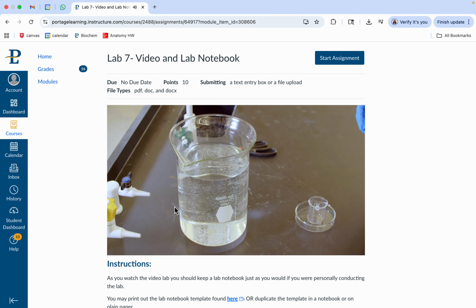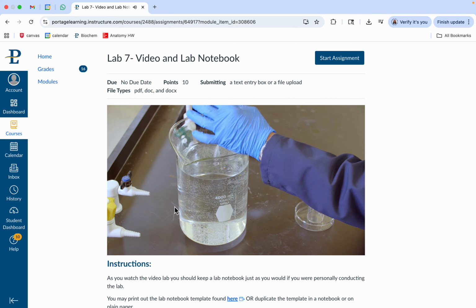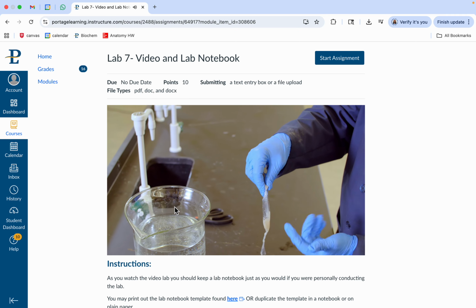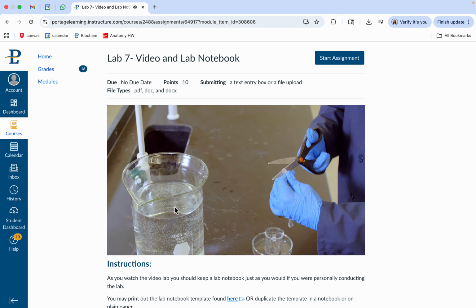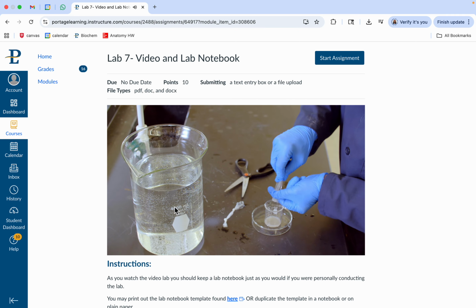All right, so we've let this dialyze overnight, and again, oftentimes you can change this. With a really low volume of protein and a really large volume of buffer, one day is good enough based on our history. And so what we need to do now is get our protein solution from here and get it into this beaker. An easy way to do this, of course, is just to cut the dialysis tubing. First, you want to make sure that you keep it in the beaker. So always have a little tray, a little backup container in case something spills.